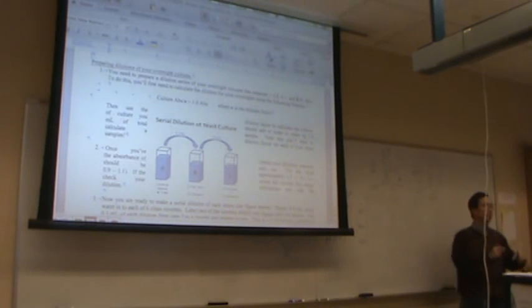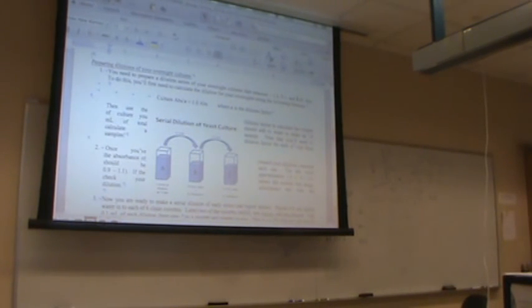I'll make sure there's a spot, and I will not touch it or shake it, and just put it here. Then after I add 90 microliters to the 9th spot, I just leave it there. At the end of the class, hopefully the liquid has dried, and then we put it upside down in the incubator. Wait, what does that say? 10 microliters plus 90 microliters of water, yeah, and then the other one's 10 microliters of the second one plus 90 microliters of water.